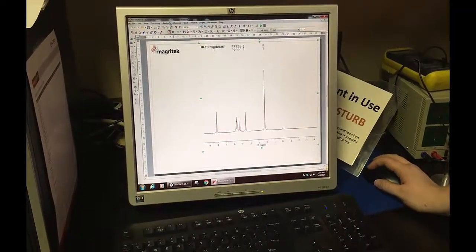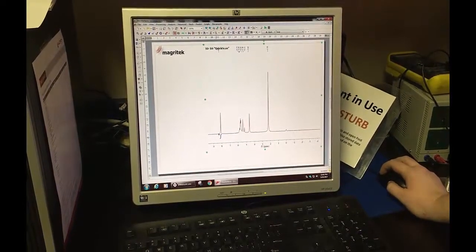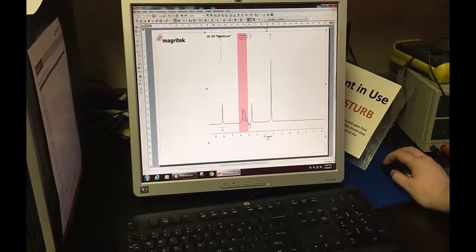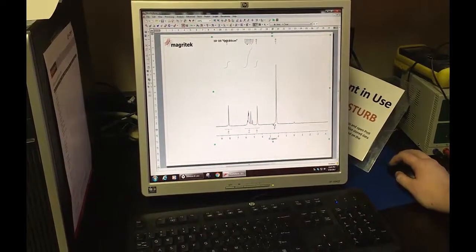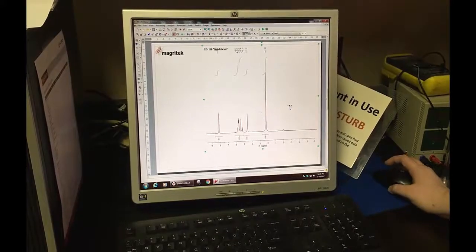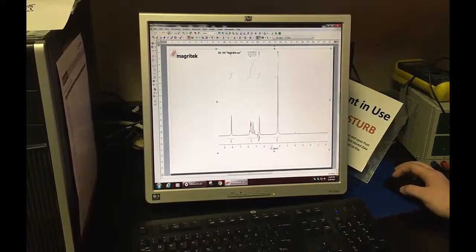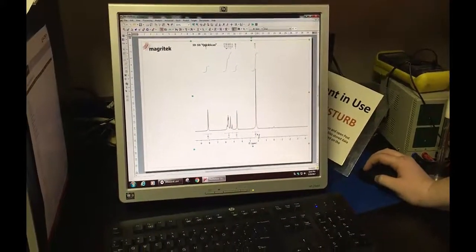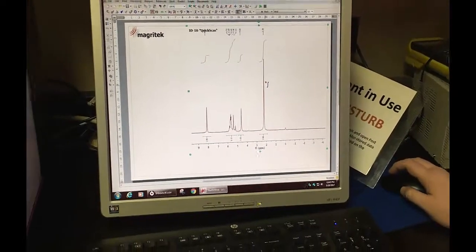So after you've chosen your peaks, go back to Analysis and go to Integration and click Manual. Then you'll start on this side of the peak where it's flat and go to the other side where it flattens out. And this is a group of hydrogens that's going to be all on the same area. So I'll pick all of those, this big peak, and this one. Now integration is going to show you how many hydrogens are represented by those peaks. Since they're all about the same height, those are going to be about 1 hydrogen each, because the numbers down here are all at 1. This one here is very close to 3, as you can see down here by the integration numbers. So since it's closer to 3, that means it's represented by 3 symmetrical hydrogens.